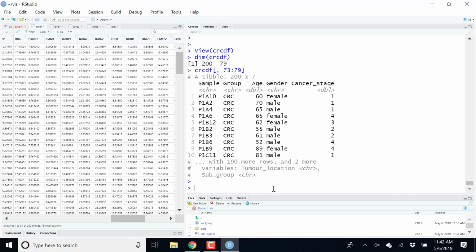So using this data set, I would like to introduce a new data structure that is important in high throughput biology, whether that's proteomics, RNA-seq, or others. And this data set can be represented like this. First, we have a matrix like this one, where we have our features, proteins, genes, transcripts along rows, and we have our samples along the columns, exactly as we have seen here, and we have only quantitative data in here.